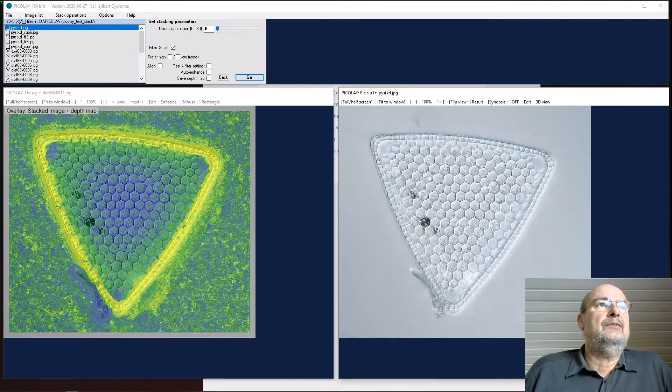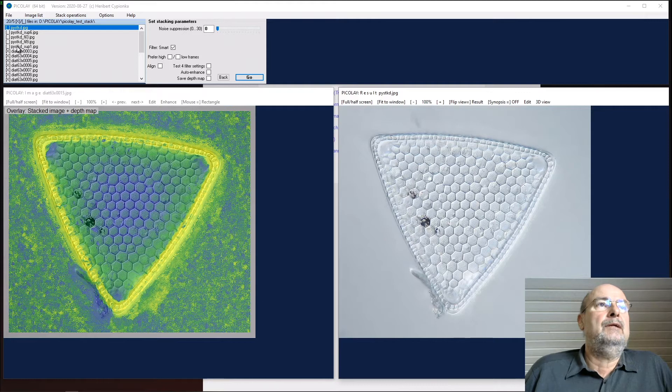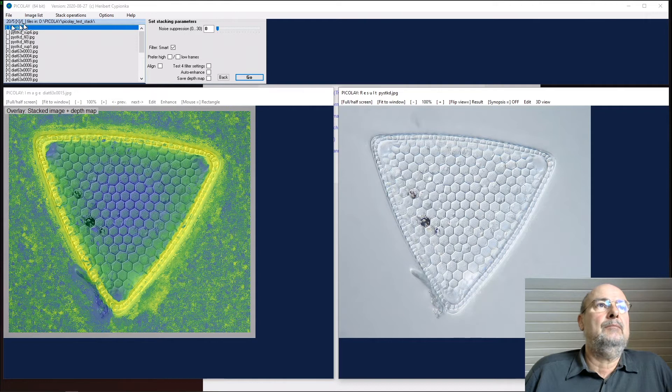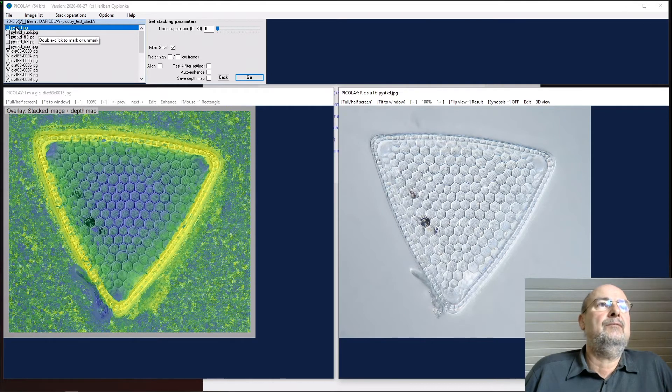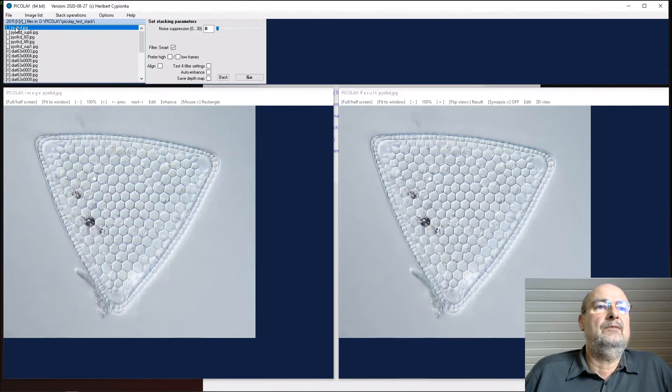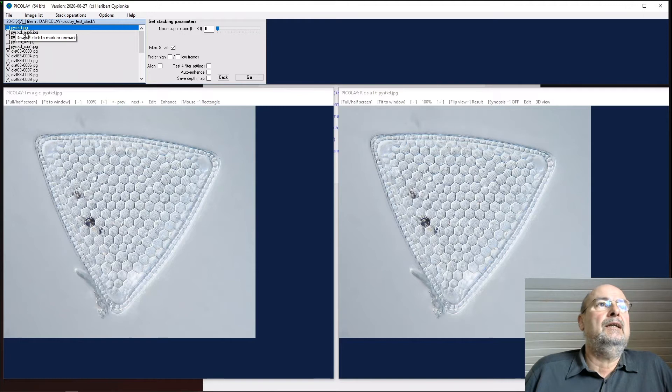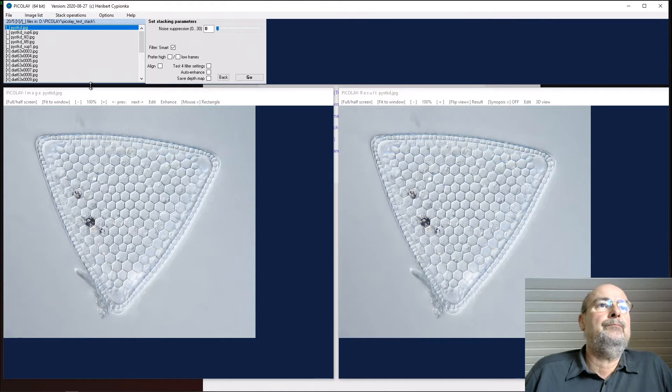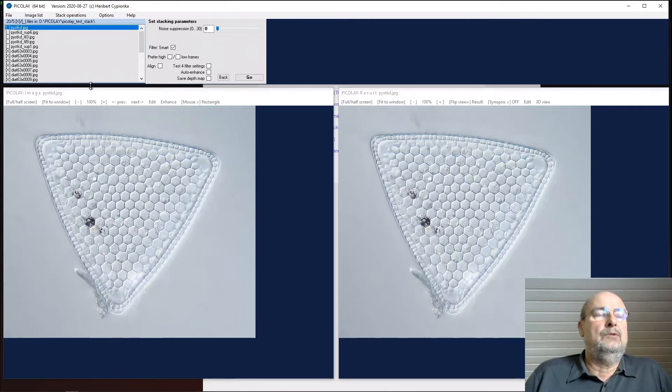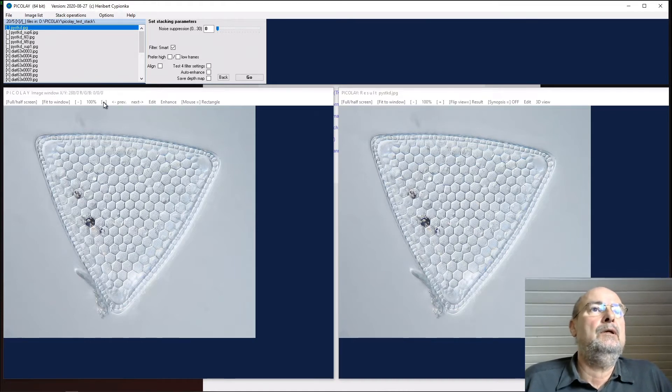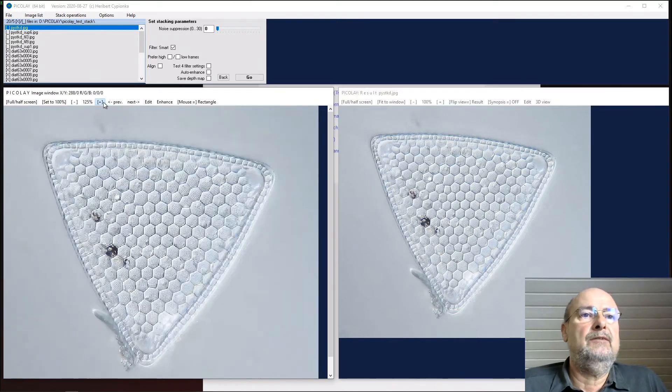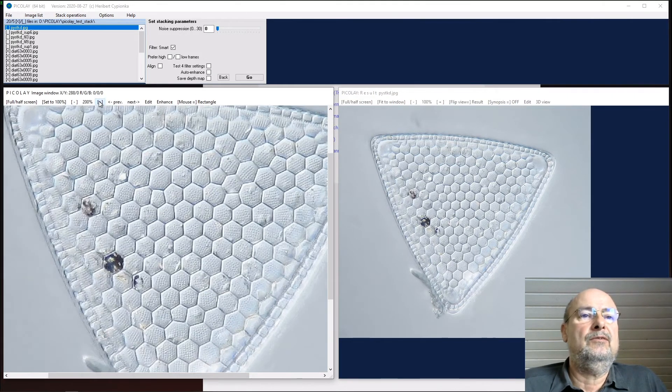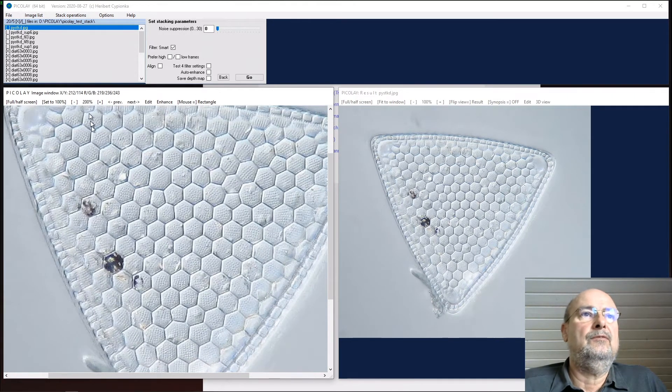These are the originals, and these are the files generated by PICOLAY. PY stands for PICOLAY, stacked stands for stacked, and here you can see a bit about the parameters. If nothing is changed, you have this result. If the parameters are changed, they're shown here in the names.